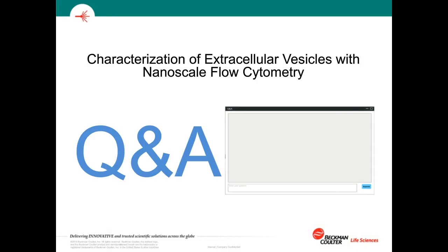Okay, all right, so the first question for you is, how can I differentiate between particulate in the sample probe or the sheath solution? Well, this is actually quite easy. If there's particulate in the sample probe, depending on the rate that you flow it at, it's going to change the amount of particulate that's flowing. So you can just alter the flow rate, and you actually see more or less debris. If it's in the sheath, it would stay constant because the sheath rate does not change.